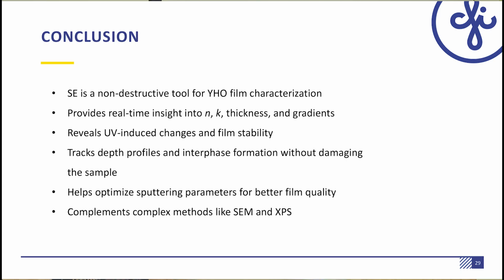Unlike SEM or XPS, which often require sample preparation, vacuum conditions, or even material removal and destruction, ellipsometry provides real-time, contactless insight into optical constants and thickness of the film, depth gradient and interface changes, photo-induced effects under UV light, stability and reversibility of optical switching.